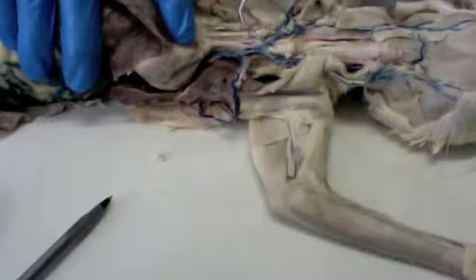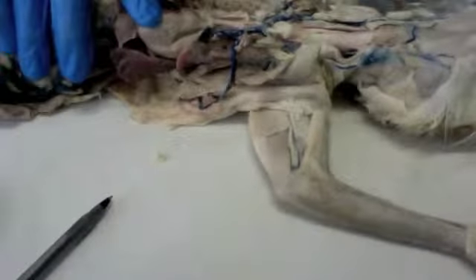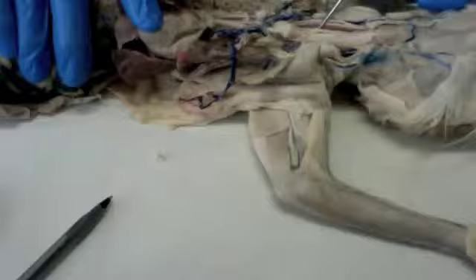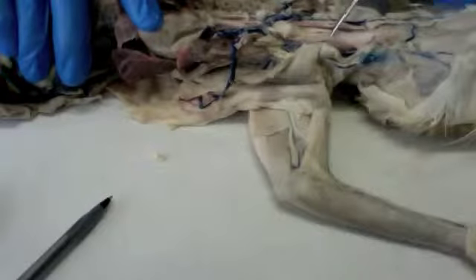And then we have the right and left common carotid arteries. Let me see if I can get this hook underneath here. It's located here. This is the left carotid artery. This is the right carotid artery.